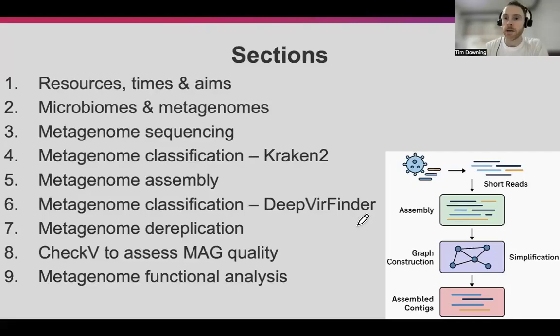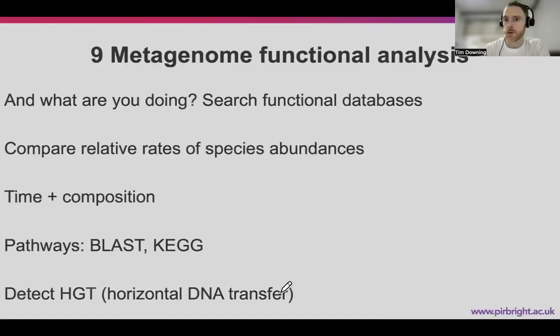Okay, welcome to video 8 and our introduction part of our course G08 on metagenomics in terms of viruses. And here we're going to look briefly at some aspects of basic functional analyses. So there's a wide variety of databases already outlined from which we can derive functional information, and that is also introduced into the estimate of the relative abundances of the different species. The classic ones are looking up information in KEGG and doing GO analysis or using BLAST to explore these things.